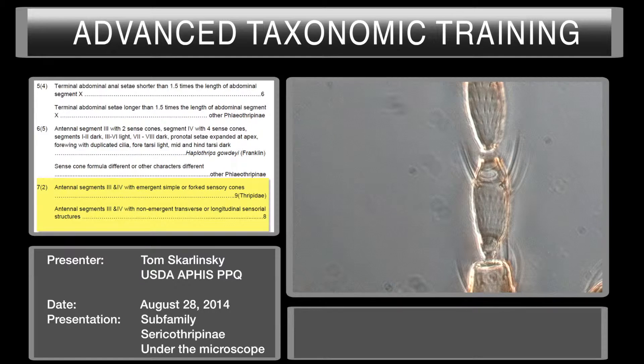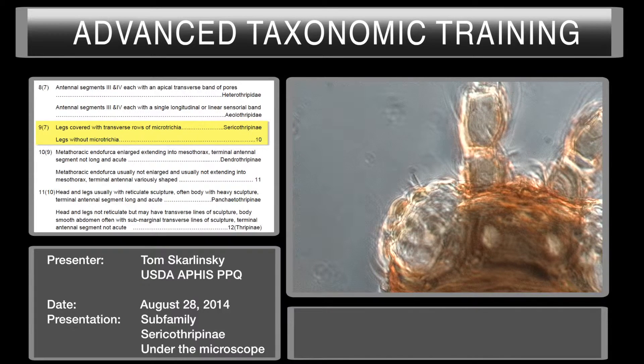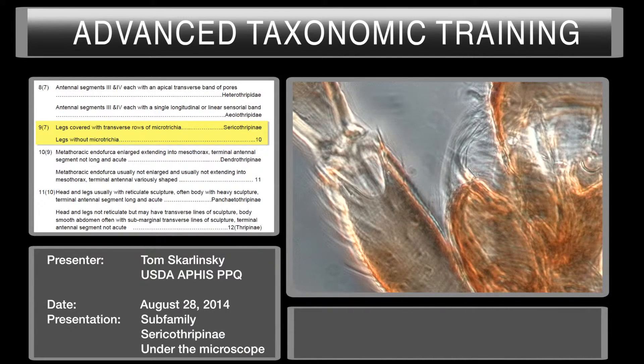So we're going to move over to couplet number nine. We want to check whether the legs are covered with transverse rows of microtrichia. Microtrichia are just like setae wannabes — in other words, they never really get long, they're very small setae. These microtrichia always look like razor stubble.